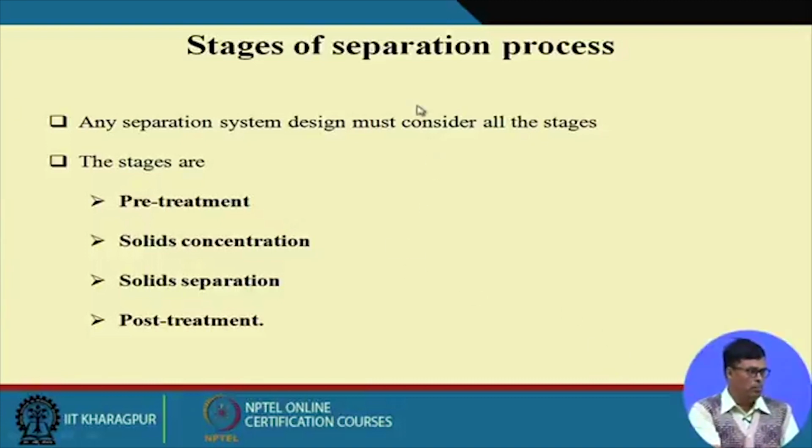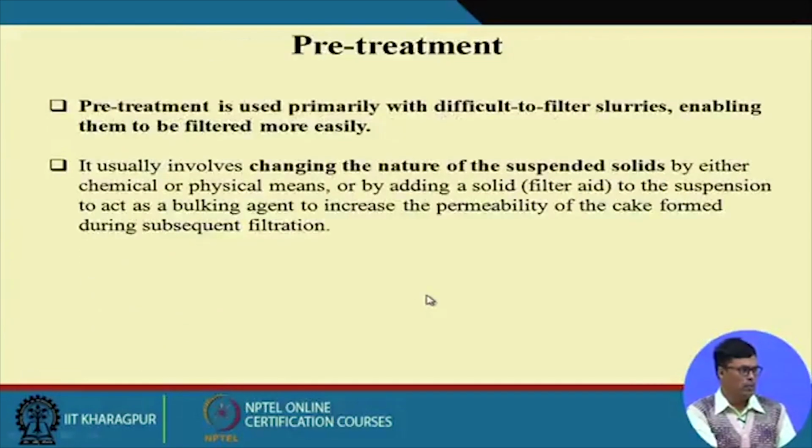Now, the stages of the separation process. Any separation system design must consider all stages. The different stages of this separation process are: pre-treatment, then solid concentration, then solid separation, then post-treatment. So, pre-treatment, solid concentration, solid separation, and post-treatment.